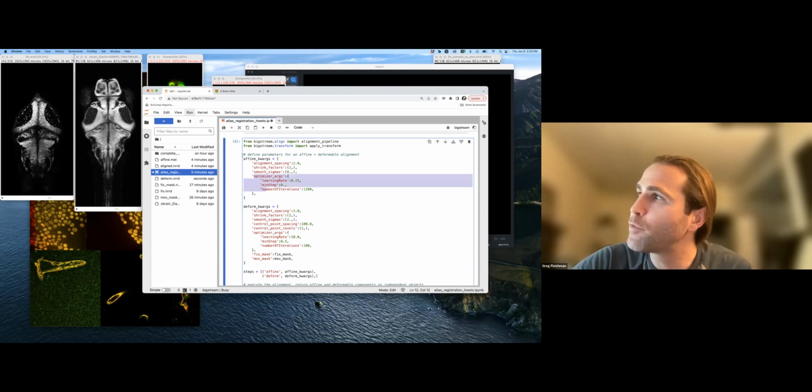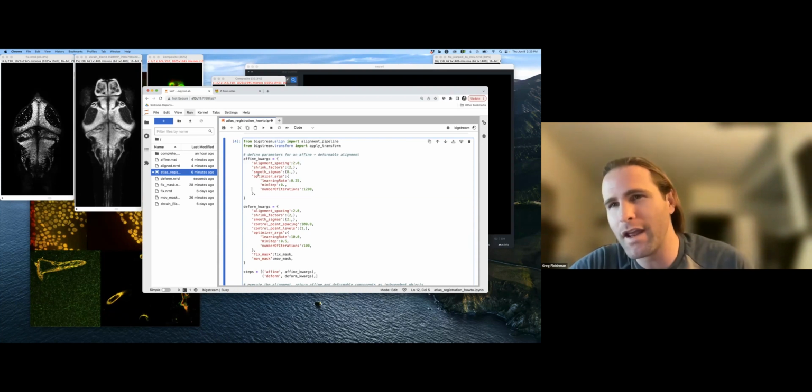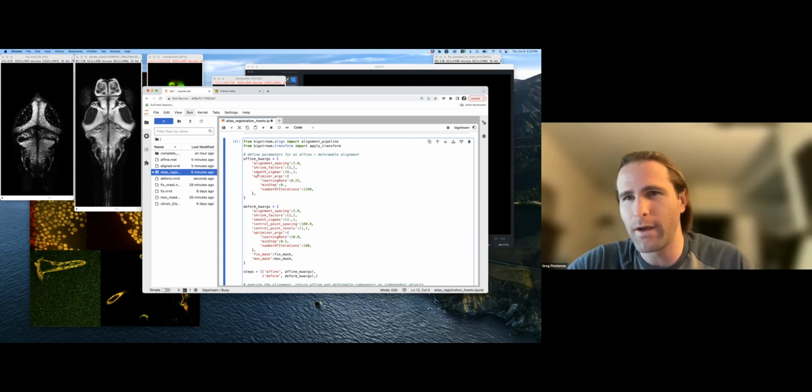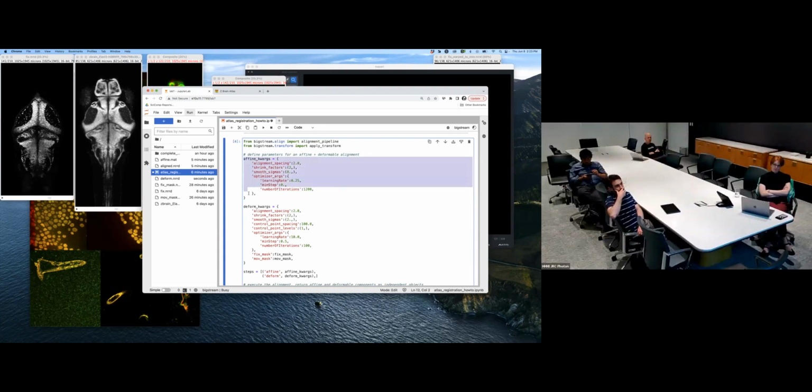These are the parameters that I leave exposed explicitly in a lot of my example notebooks because they are the ones I change the most frequently. But there are another 40 that you can change. Don't let that intimidate you. Really, it's just more power and flexibility. In many cases, you will never have to touch them. It's good that they're available to change because you have more control over the algorithm, but it can be overwhelming if all of them are in front of you at the same time. These are the most common ones.